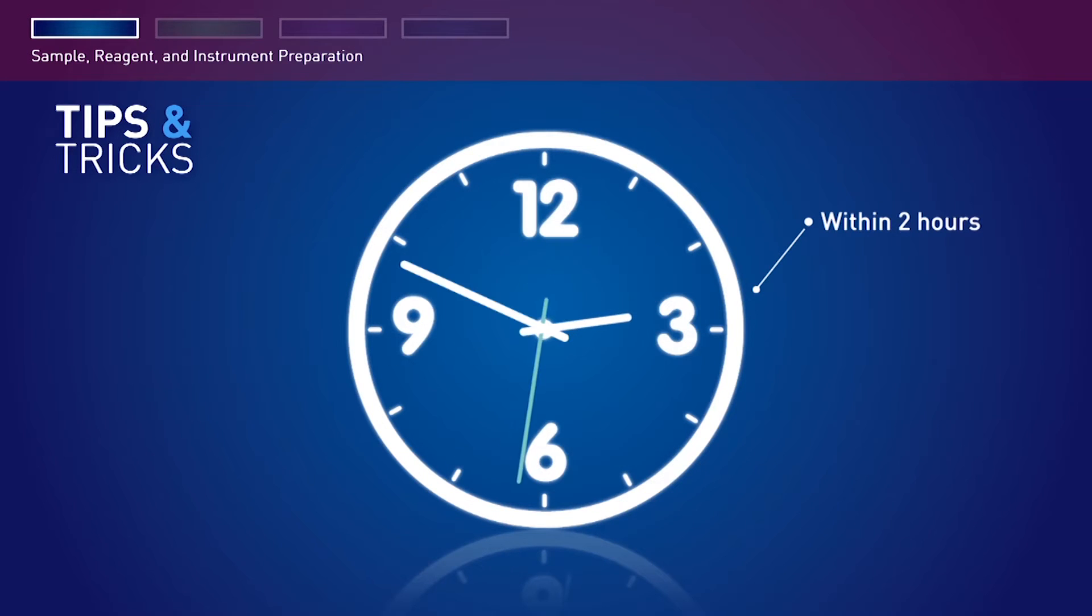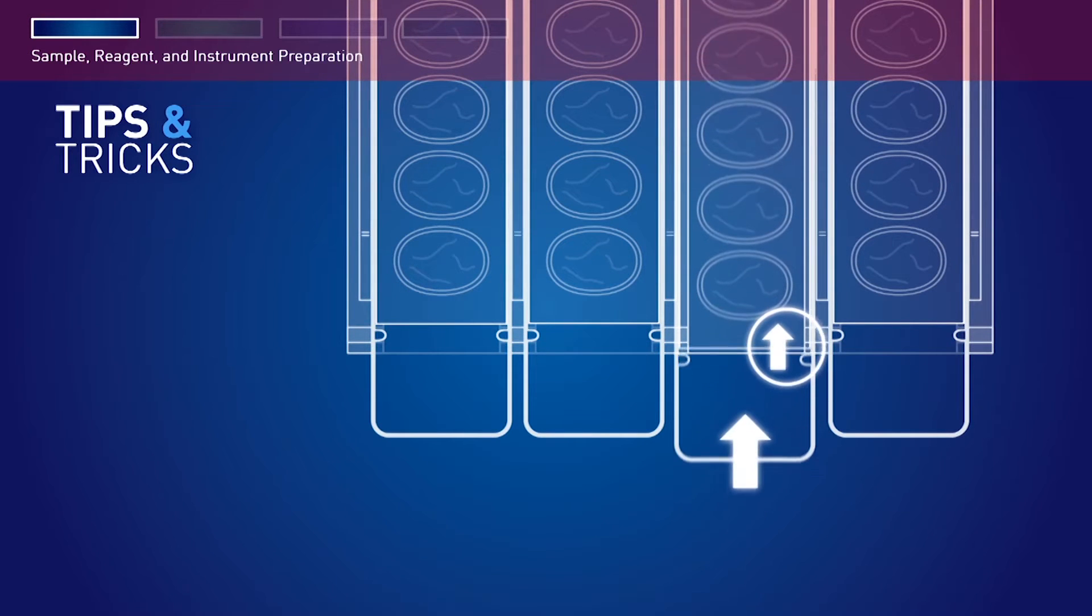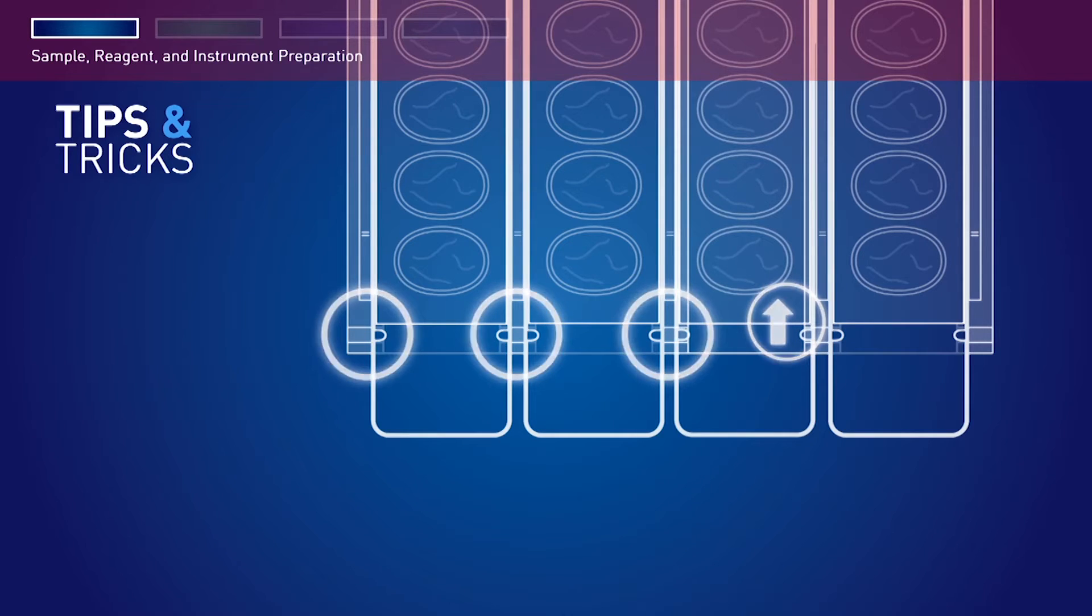When inserting the cartridges, make sure that the notches in the cartridge align with the notches in the cartridge rack.